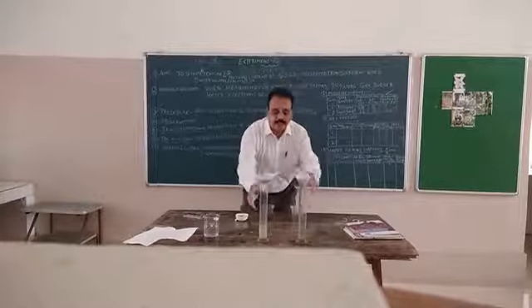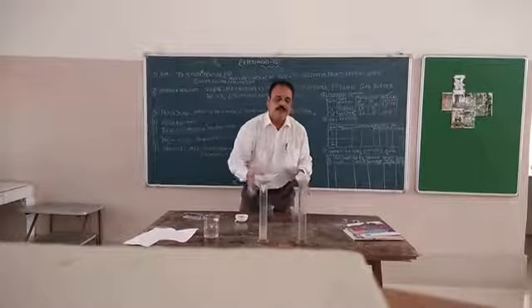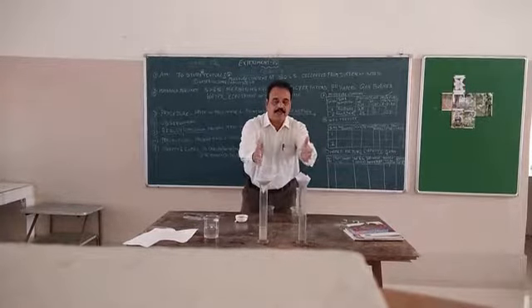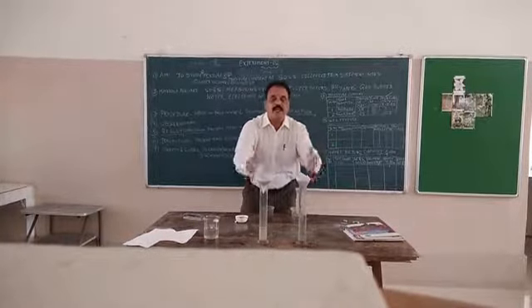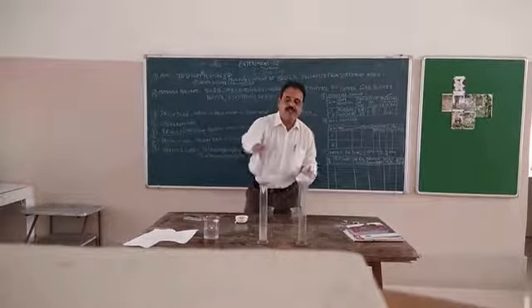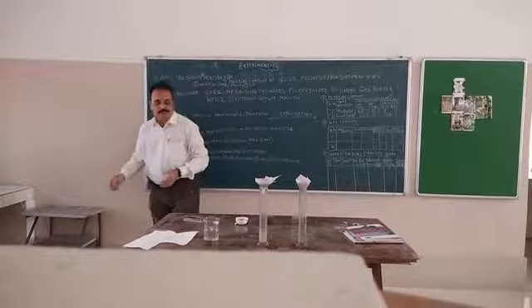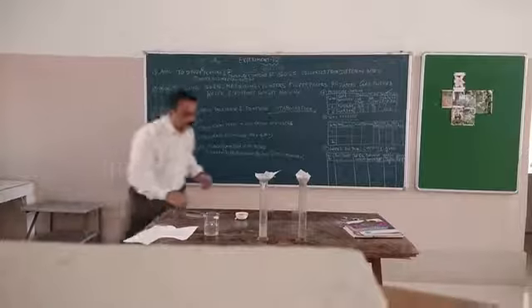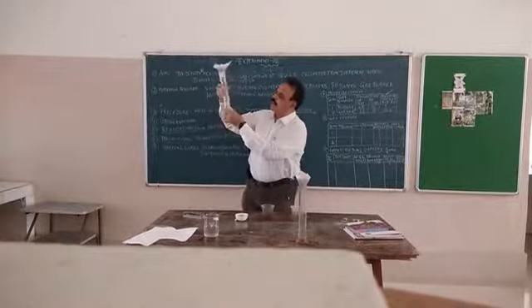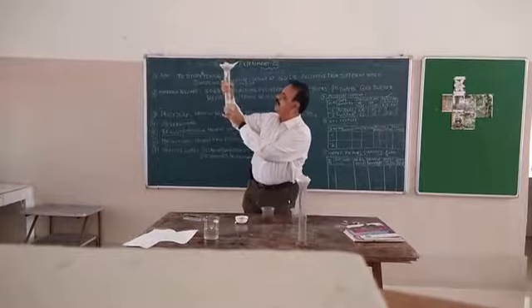And we have arranged the flask, and then we have put the filter, blotting paper we have used, initial weight 50 grams I have put, and 100 ml of water I have put. As you are seeing, when I poured the water, the filtration has already taken place, and you can see the roadside soil, I have put 100 ml, and I am sure the amount of filtrate is almost 79.